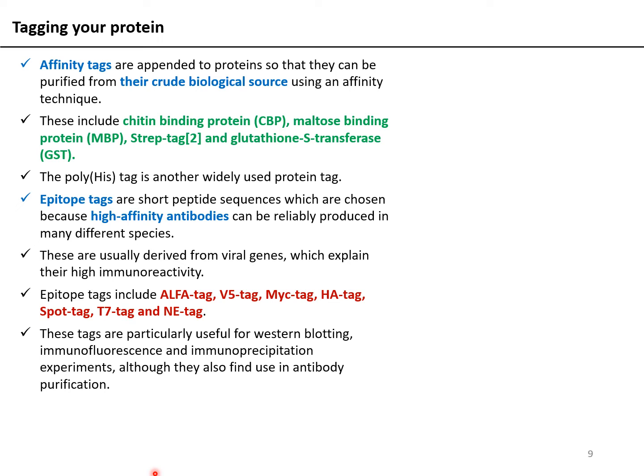And it is like a small scale purification procedure itself, I had mentioned. So for immunoprecipitation and for Western blotting, these epitope tags are very useful. Why? Because say for instance, you have 10 different proteins that you want to purify and all of them have the HA tag. So you can purify them all using HA beads, and you can visualize all of these proteins on a Western blot by using antibody against this HA. So it becomes very useful.